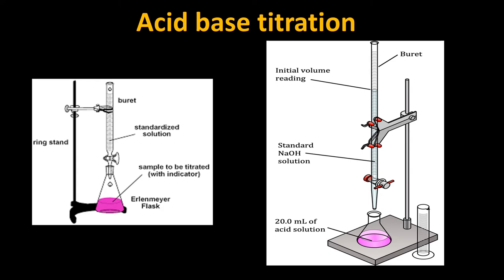We set up the titration apparatus. You can see the vertical stand here. This is the conical flask, and HCl is being added drop-wise into the sodium hydroxide solution containing phenolphthalein. After the color change to light pink, we record the readings. The reading is taken from the burette — it is a calibrated burette.